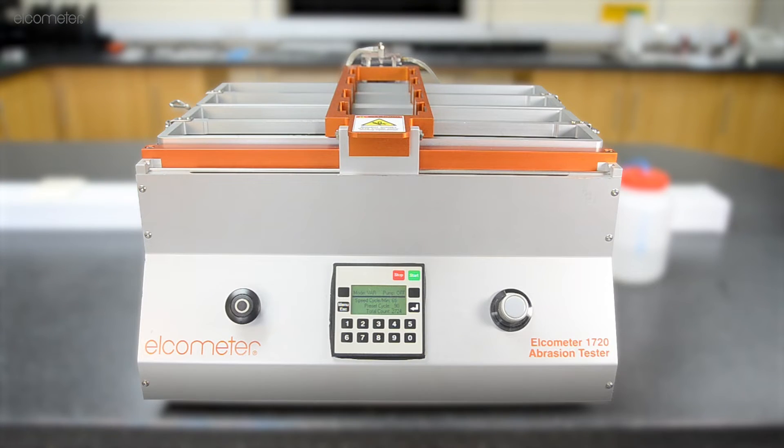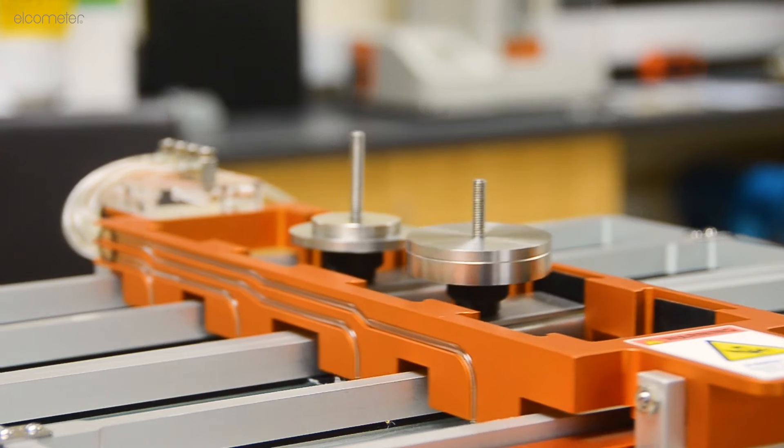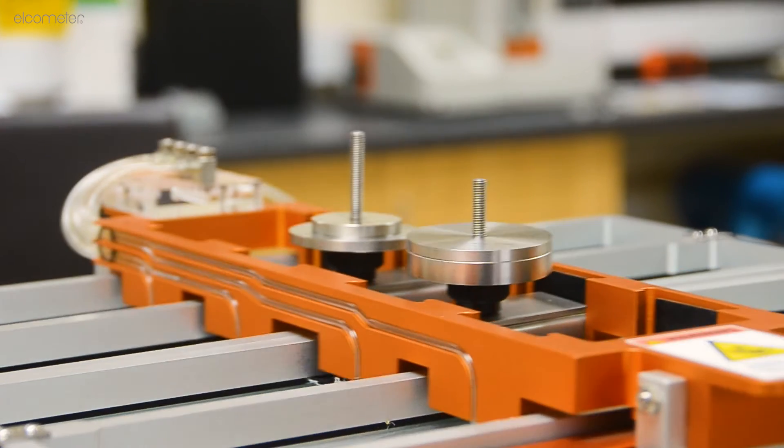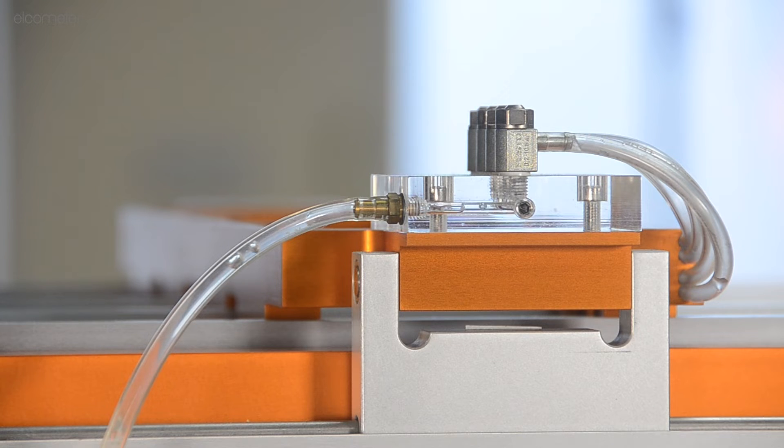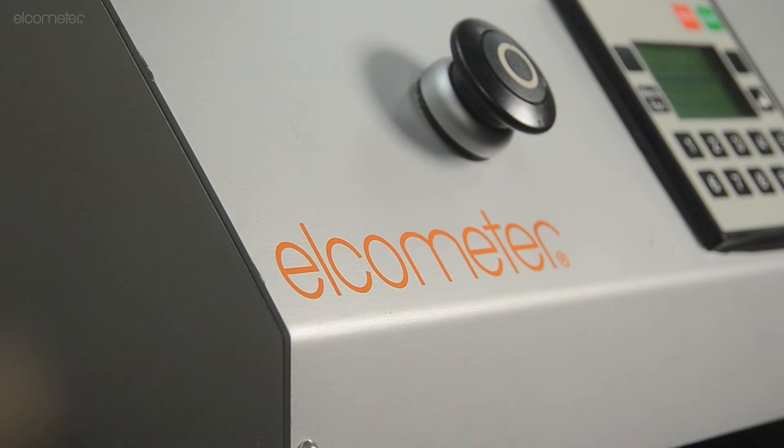The Elcometer 1720 Abrasion and Washability Tester has the ability to condense a product's lifespan to a much shorter duration, within a controlled and monitored environment in a manner that is consistent, repeatable, reproducible, and not feasible by hand.